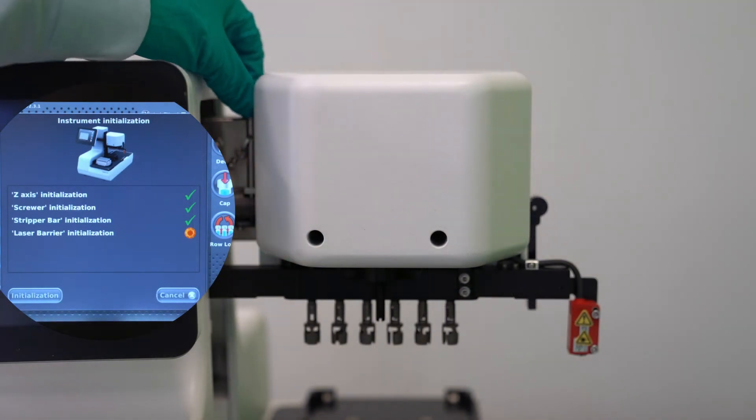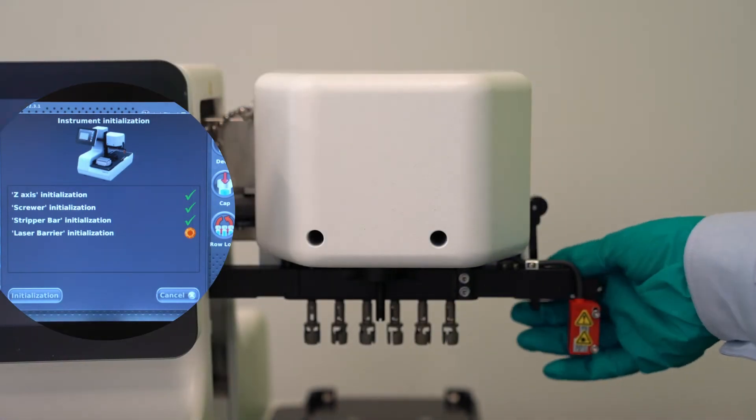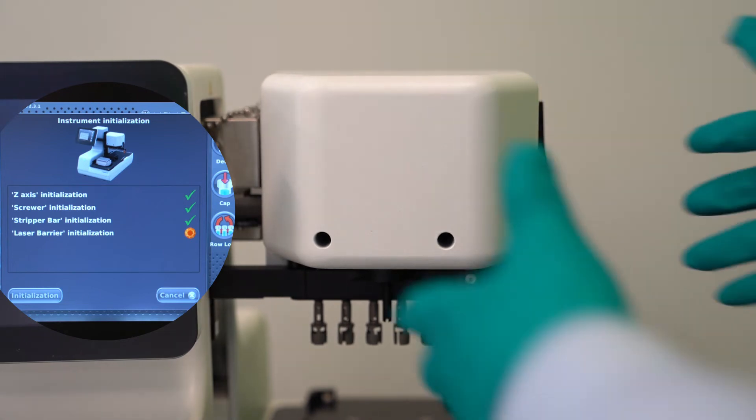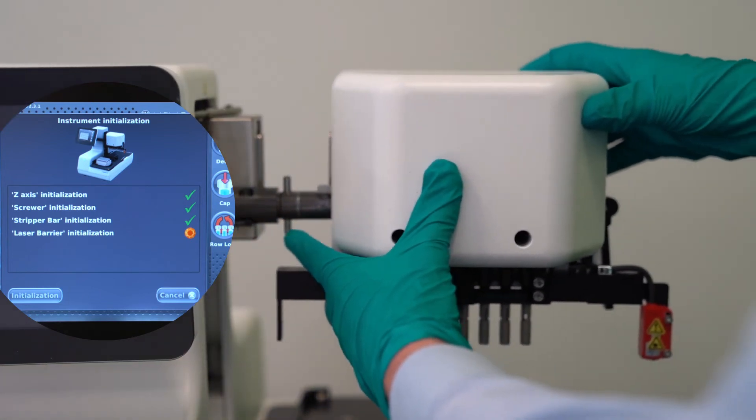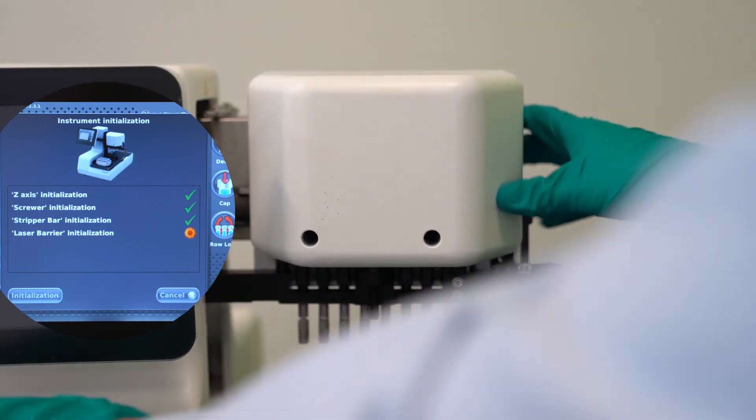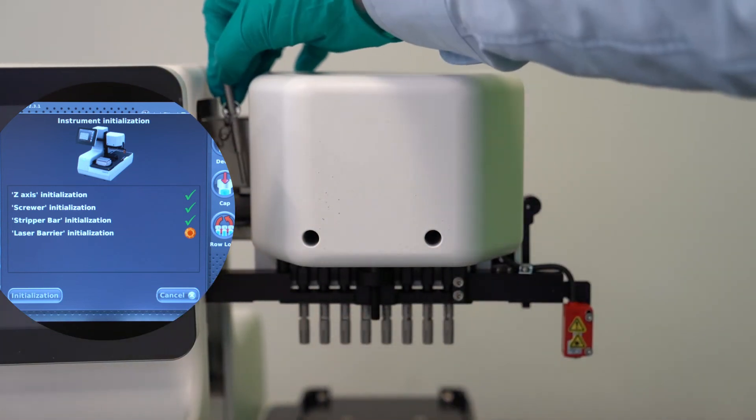Luckily, this is a quick process. With the machine off, simply pull the pin, lift the lever and replace it with the 8-channel head. Then, turn the machine on. While that initializes, we will move on.